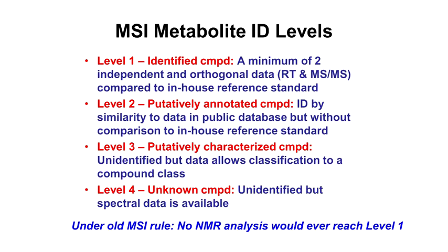Now, when you're identifying compounds, there are different levels of compound identification. And these are the 4 levels that have been described by the Metabolomics Standards Initiative, or MSI, which was started in 2006, and a paper appeared in 2007 by a number of prominent people. The best level, or level 1, is essentially something that's been formally identified. So in the case of mass spec, it means having a tandem mass spectra as well as retention time with an authentic standard. Most people in mass spectrometry never achieve this.